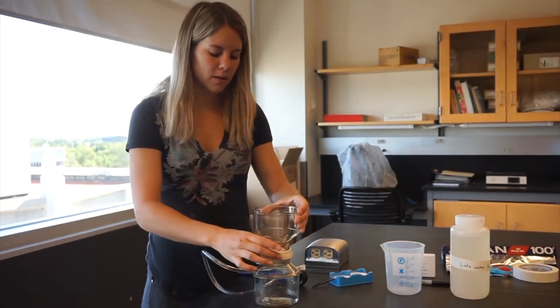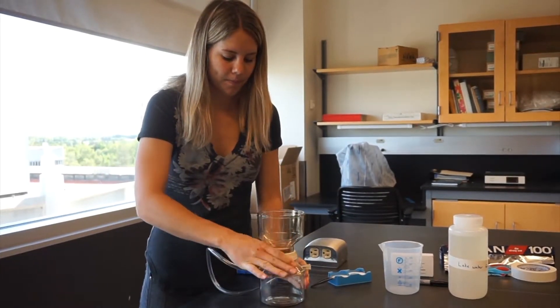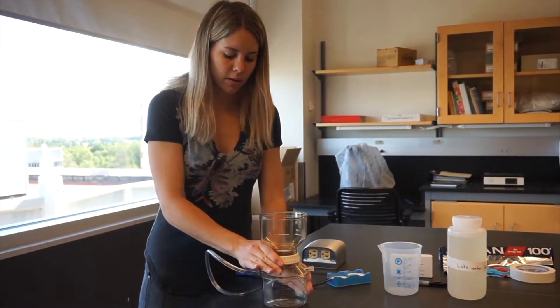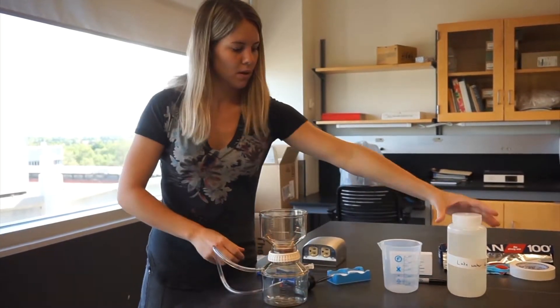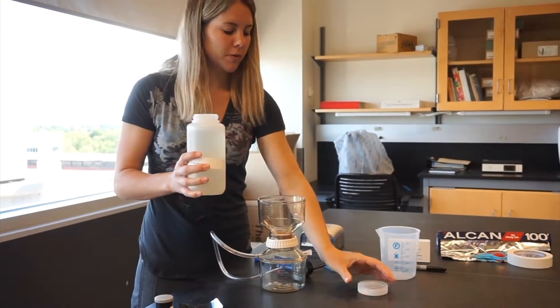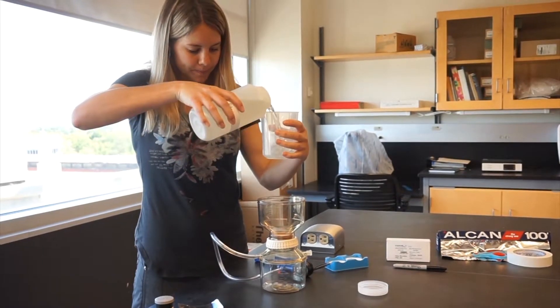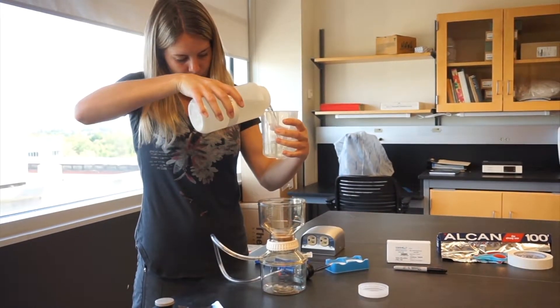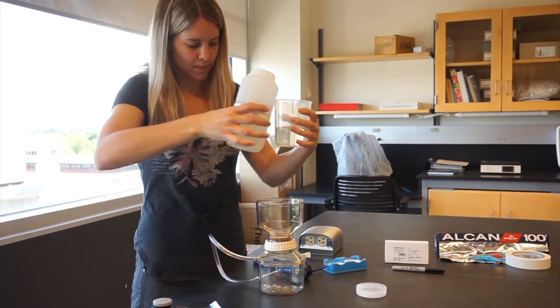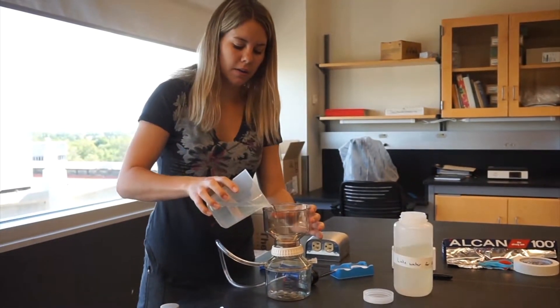Then you can screw on the top funnel. Make sure that it's sealed on tight. Next, take your filter water and you'll start with 250 milliliters using the measuring cup. Pour that into the funnel.